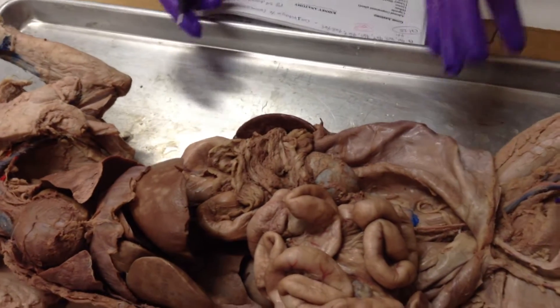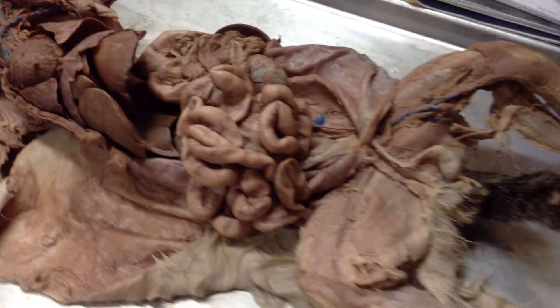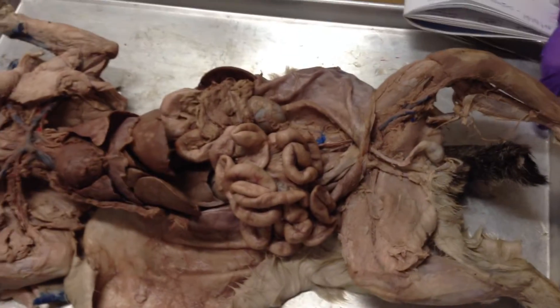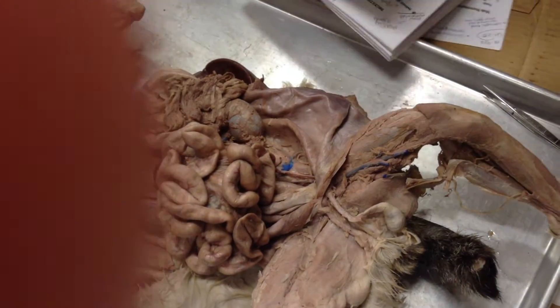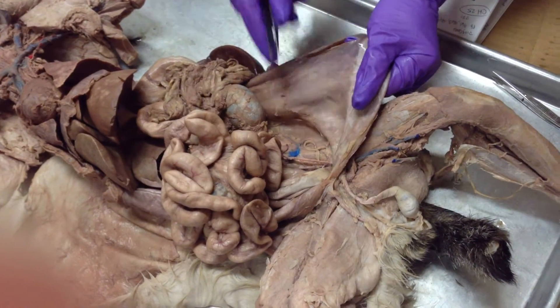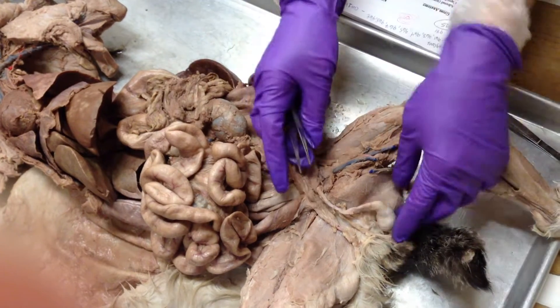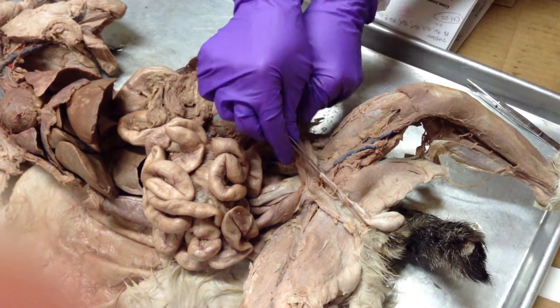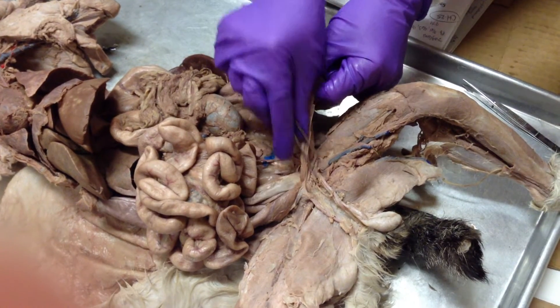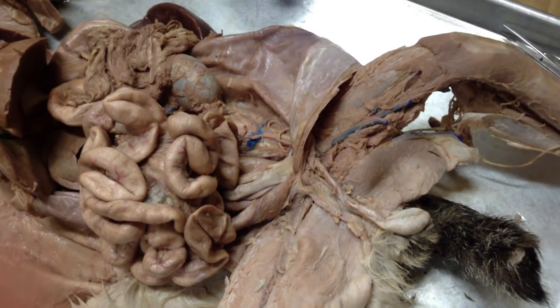This male cat has a really good body wall still attached, so one thing he could definitely test you on is the inguinal canal. The spermatic cord from the testes runs through the body wall — here are the testes and here's the spermatic cord. You can see when I do this it kind of moves because it's going right through the wall.